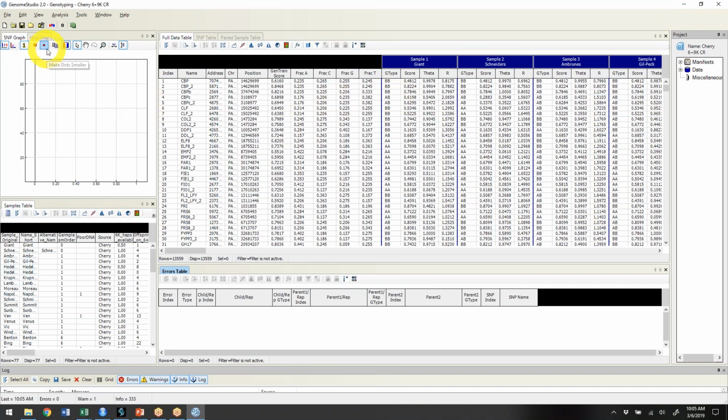So if this all worked well, you now have a project in GenomeStudio that has all the scoring for all the individuals we identify in that sample sheet. Now, if in a month from now I get some new data in, I can either redo this whole process and make a new sample sheet and load everything in, but maybe I've already adjusted a bunch of things, or I've been working in this and I don't really want to lose the progress I made.